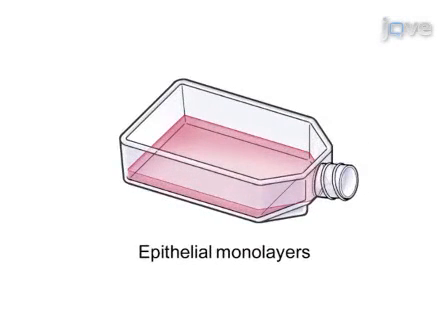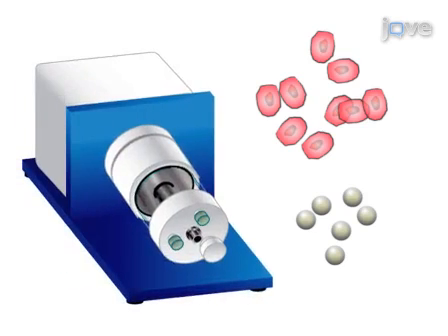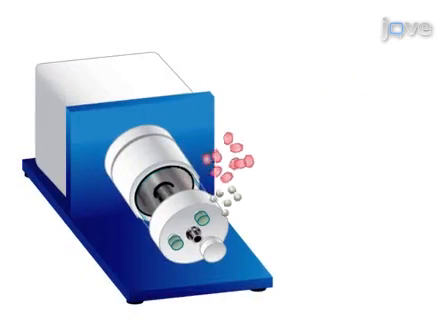First, epithelial cells are cultured to a confluent monolayer in a tissue culture flask, harvested, and then combined with microcarrier beads in the STLV bioreactor.